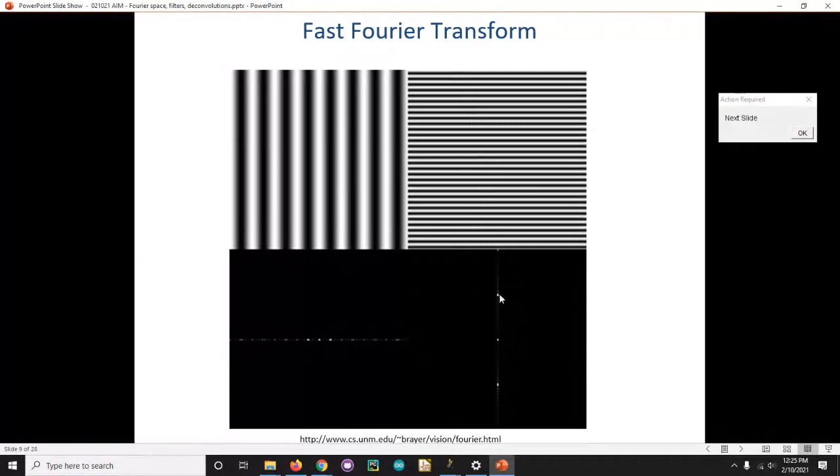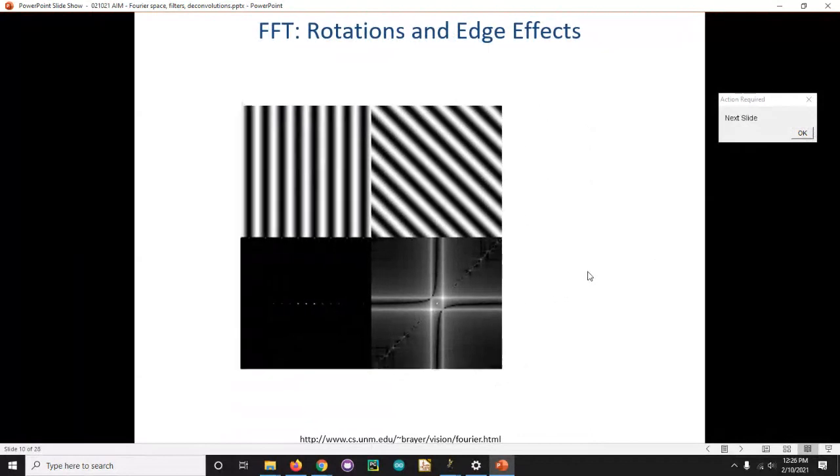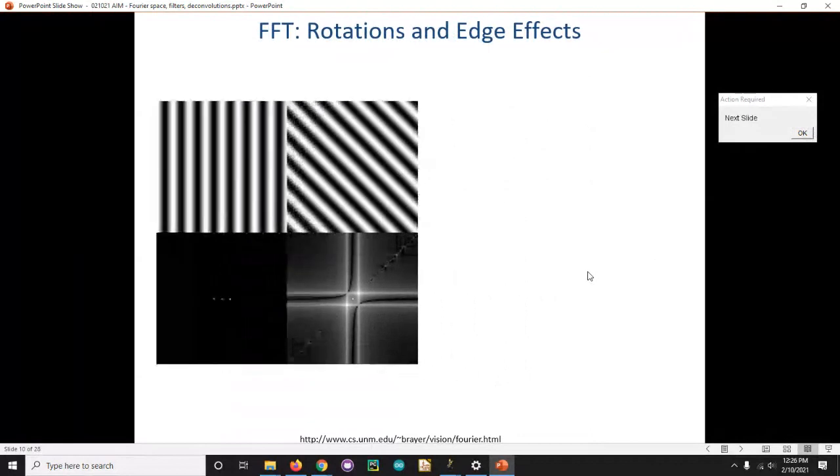In fact, we can tell that the images are pure sine waves without even looking at the images themselves, because the only way we get these single peaks in a Fourier transform is a perfect sine wave. So now that we have the perfect sine wave, we can try rotating it 45 degrees, and it falls apart. And it's like, whoa, what happened? This is pretty straightforward. Sine waves give you points in your Fourier transform. And so you see this in most of your biological sample Fourier transforms.